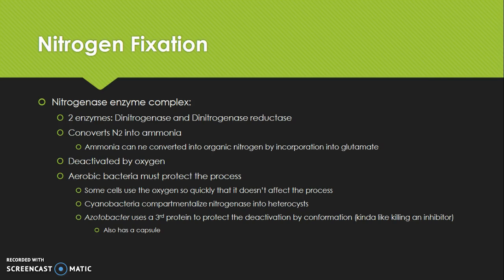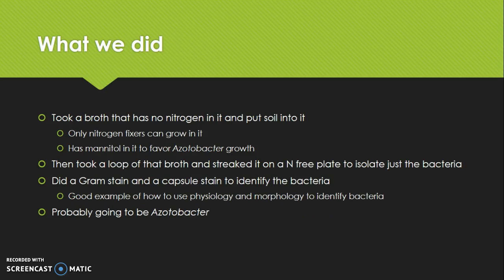So it doesn't affect the complex. And then also on top of that, Azotobacter also has this capsule, which doesn't allow things to move in and out as easily as possible. So the capsule kind of protects it in that manner too. So it's kind of got a twofold little protection scheme.